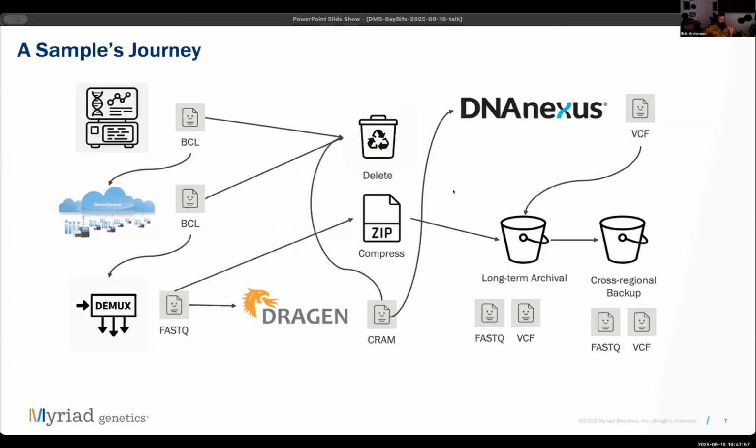This way, the DMS not only tracks files, but actively governs their lifecycle. By tying together workflow events, file identities, and storage policies, we ensure data is accurate, its integrity and provenance is always clear, efficient, by eliminating redundancy, we control our costs, and compliant. Each step along the way, we produce auditable, directly relevant records of what was kept, retired, or archived.